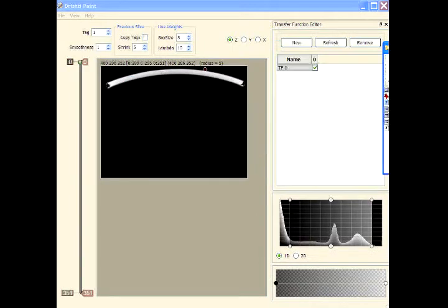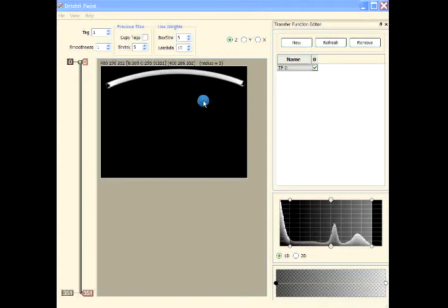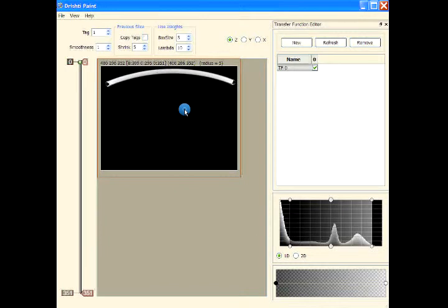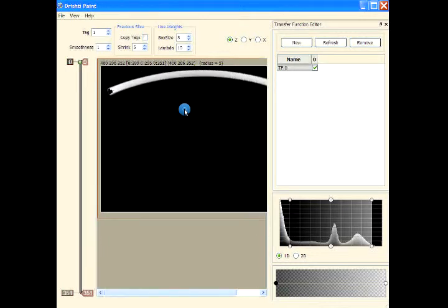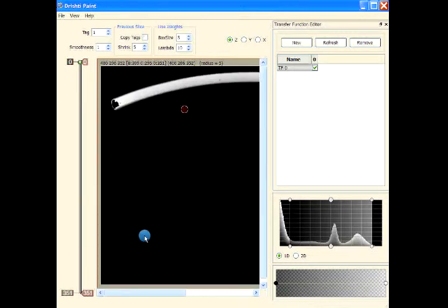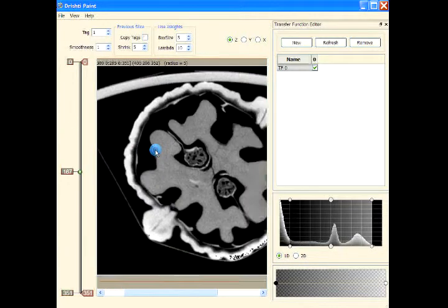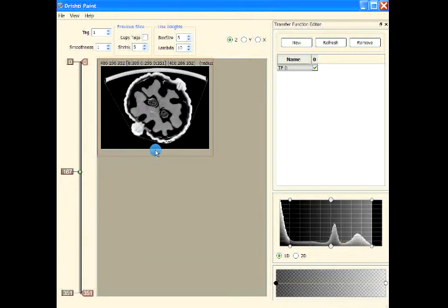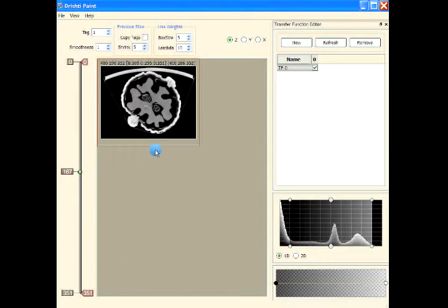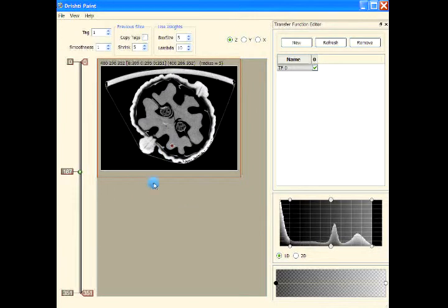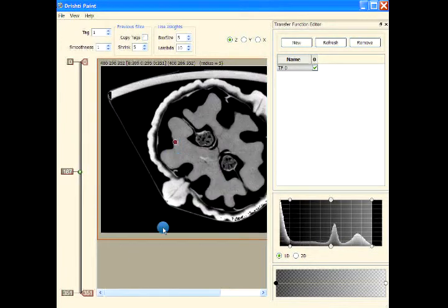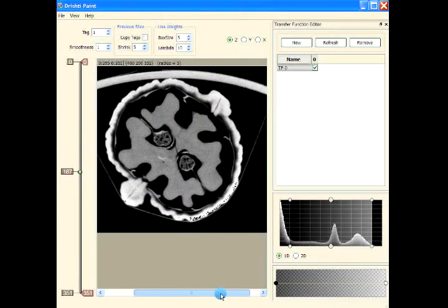Control+Zero will set the original size, then Control+Plus to increase the size of the image, and Control+Minus to reduce the size. Control+Zero brings it back to the original size.